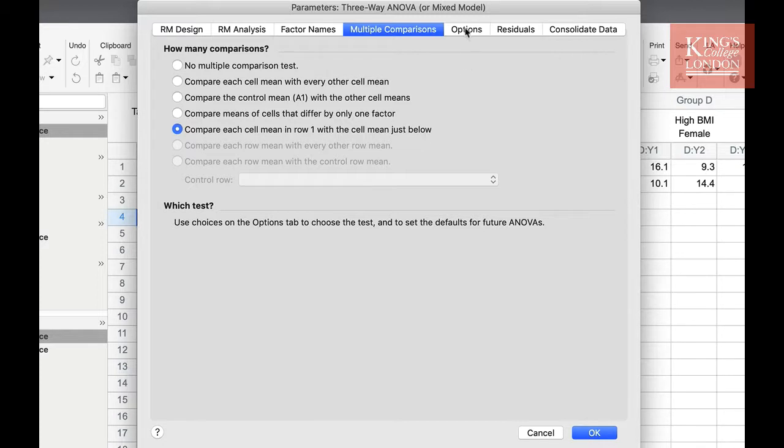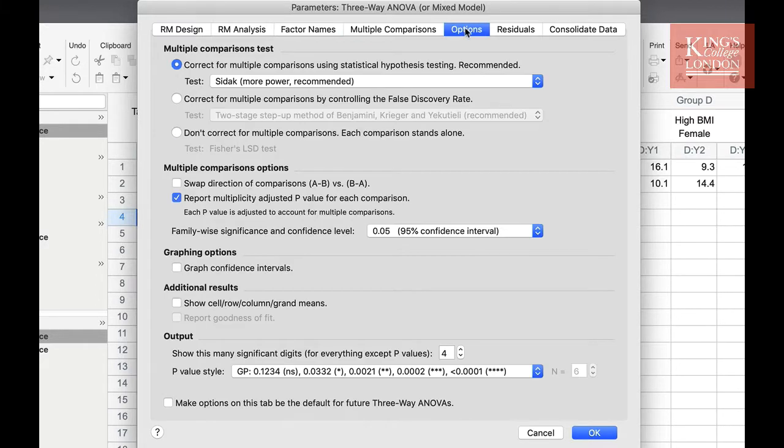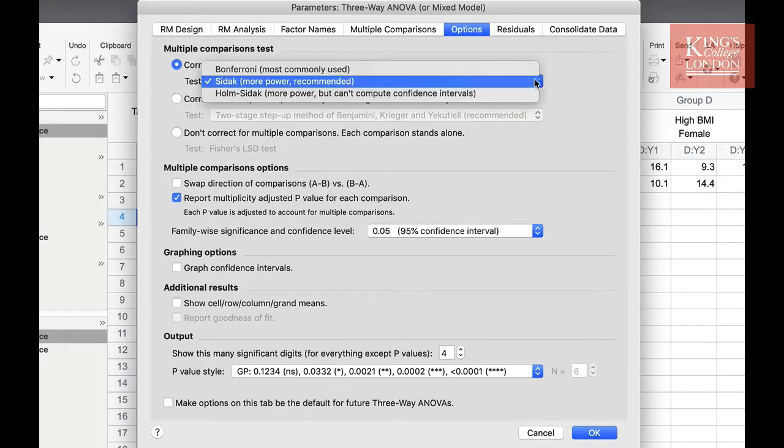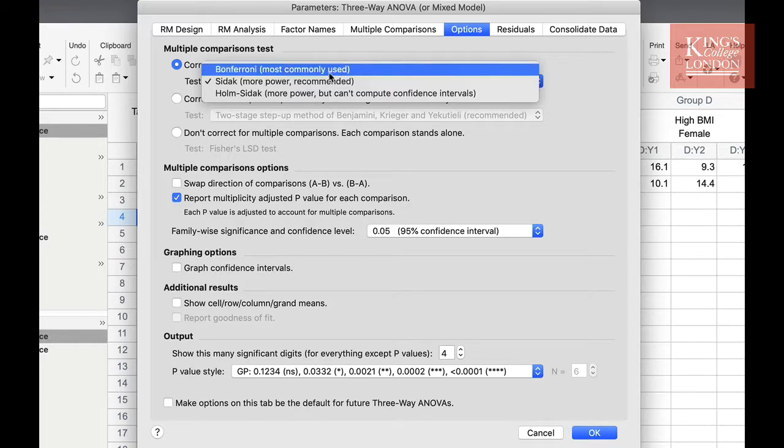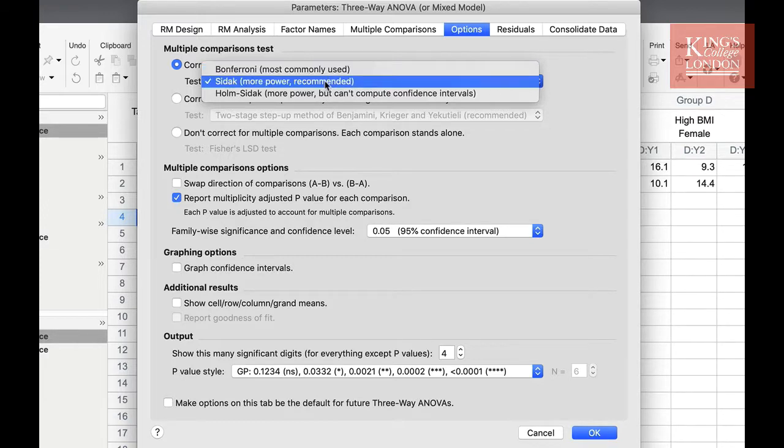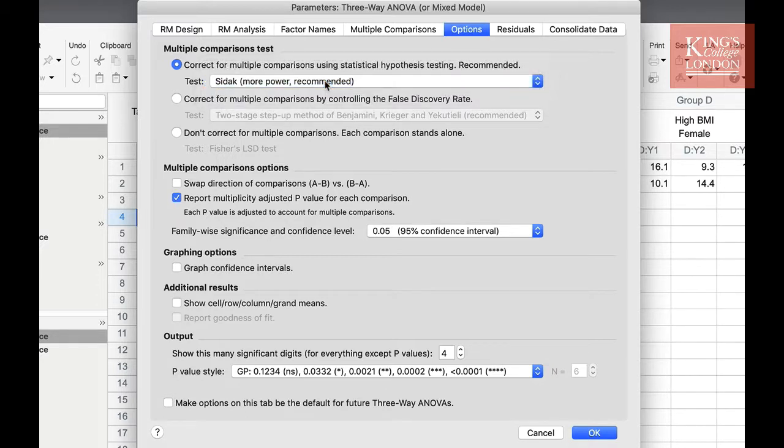Beyond this, we have multiple options for the type of multiple comparison test we are choosing. Of course, we recommend you choose the recommended test, but you can choose from this drop-down list a number of other tests. I am going to choose the Sidak since it is recommended.